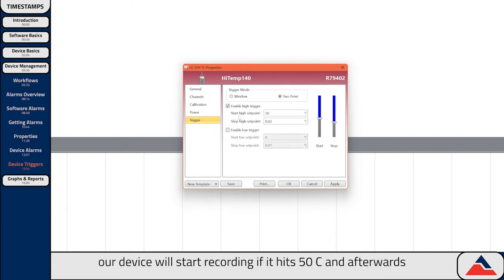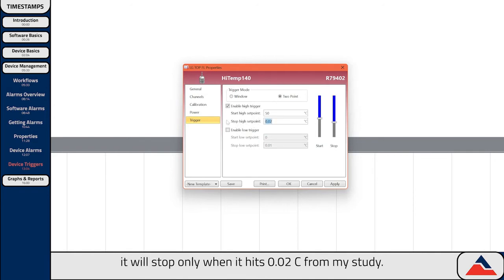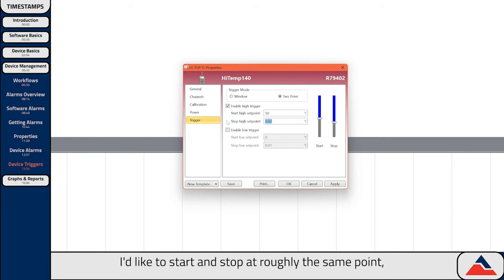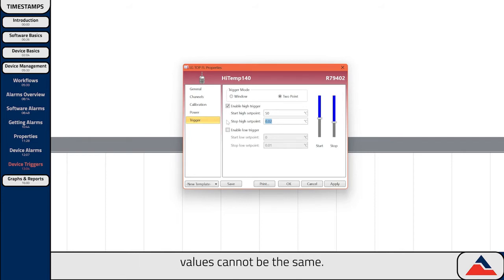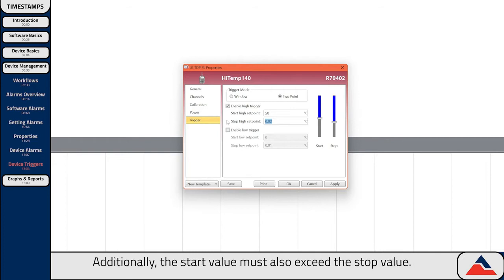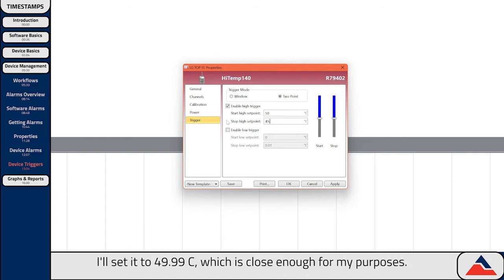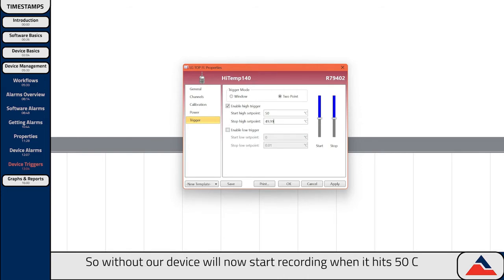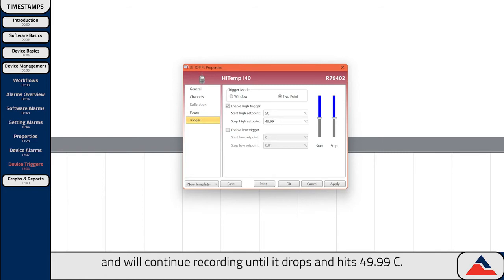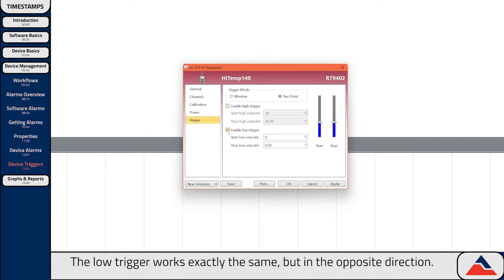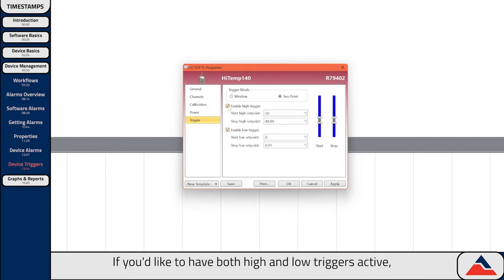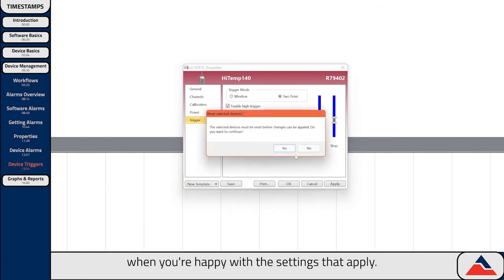For simplicity we're going to start with just the high trigger. Right now our device will start recording if it hits 50°C, and afterwards it will stop only when it hits 0.02°C. The start and stop values cannot be the same, and the start value must also exceed the stop value — this is to prevent the stop trigger from being hit immediately after the device starts. So I'll set the stop to 49.99°C, which is close enough for my purposes. Our device will now start recording when it hits 50°C, and will continue recording until it drops and hits 49.99°C. The low trigger works exactly the same but in the opposite direction. When you're happy with your settings, hit Apply. You can also create a template by hitting Save at the bottom.